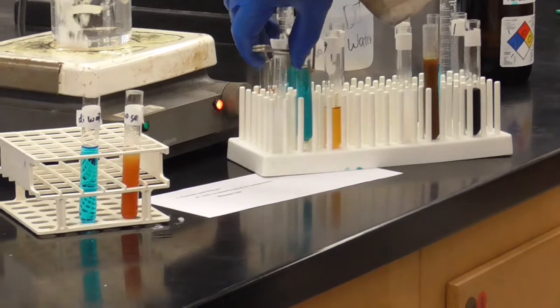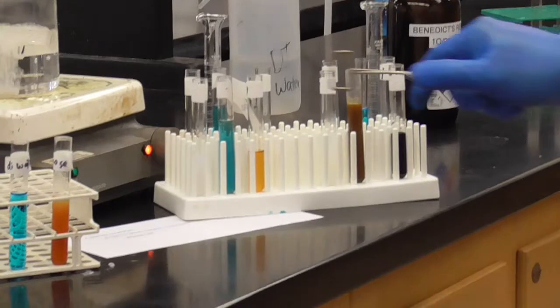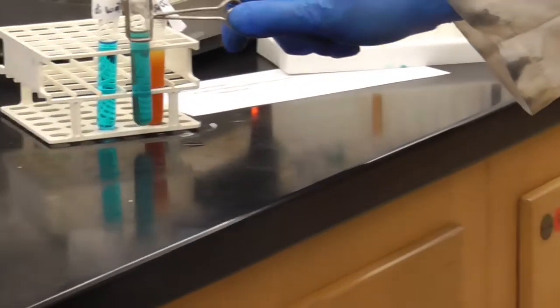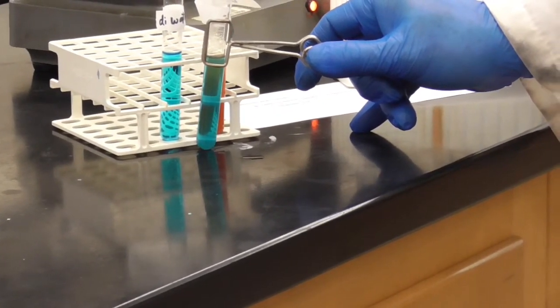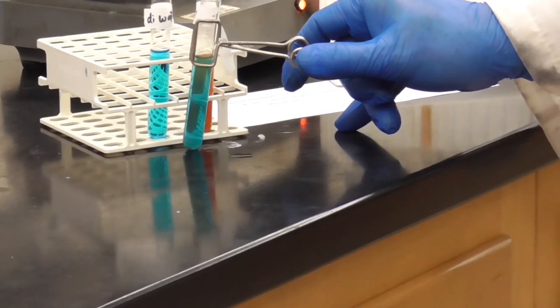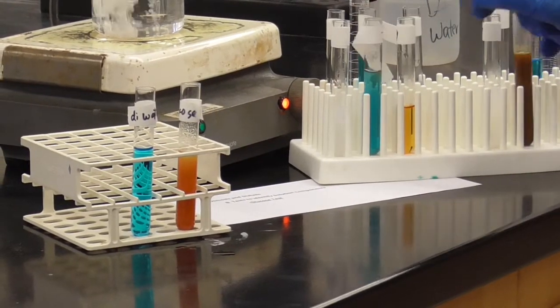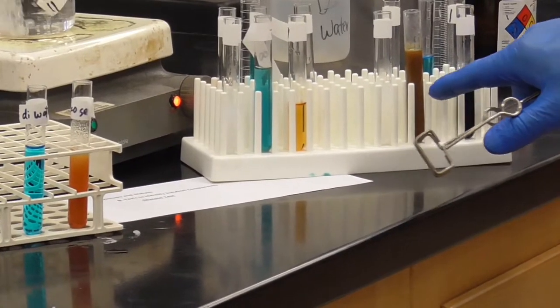Looks like that. And what I want you to do is look very carefully at that, actually. Because in fact, I'm going to pick it up and bring it right next to the positive and the negatives here. Hopefully you can see that while, yes, it's still blue, it is not a pure negative like the negative control was. You can see it's got a little bit of color into it, a little bit of darkening, a little bit of brown in there. So while that's not a strong positive test, nevertheless, we are detecting a little bit of glucose. So most of the glucose stayed in the bag, but you know what?